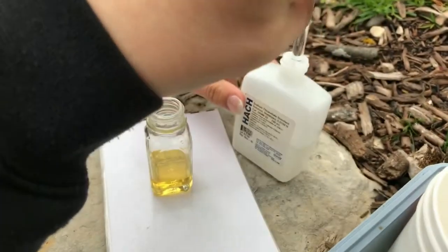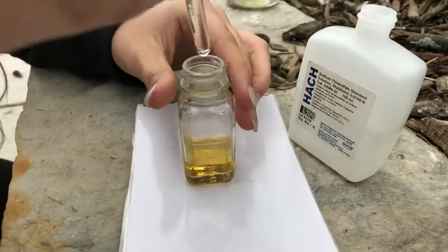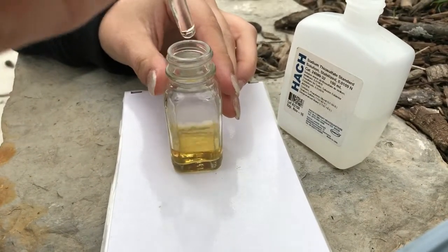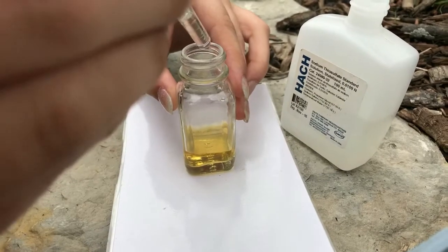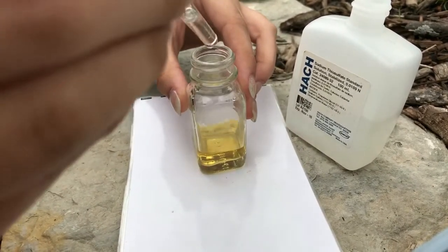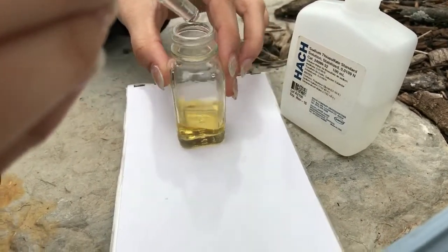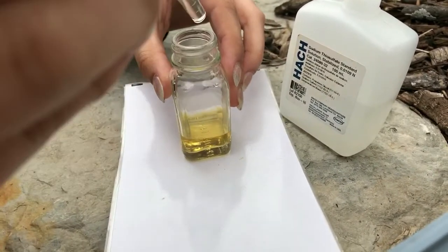Next you will want to add some sodium thiosulfate using an eyedropper to the solution, drop by drop. Keep an eye out for and count how many drops it takes for the solution to turn transparent. Make sure you are counting, as this will later be used to calculate a Q value for the biochemical oxygen demand.